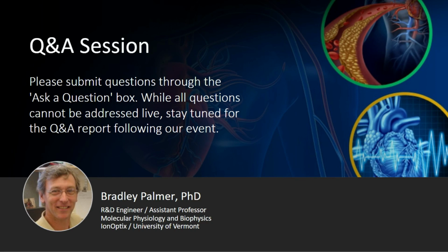I think you just may have to be aware of what disease states you're actually examining. We've looked at disease states of dilated cardiomyopathies, for example, so they have poor contractile dynamics. And with the poor contractile dynamics, we did have to be a little bit more careful about how we generated work loops because there's just poor contraction.